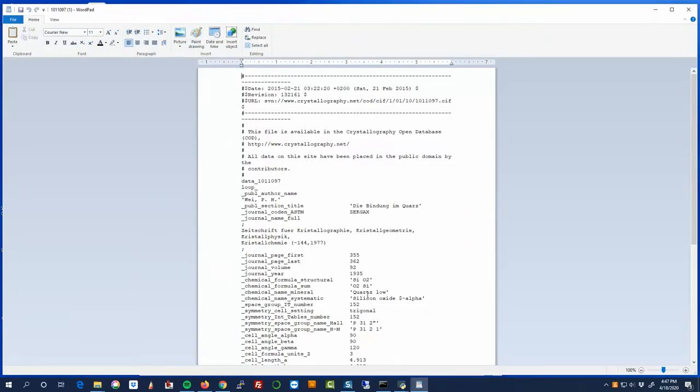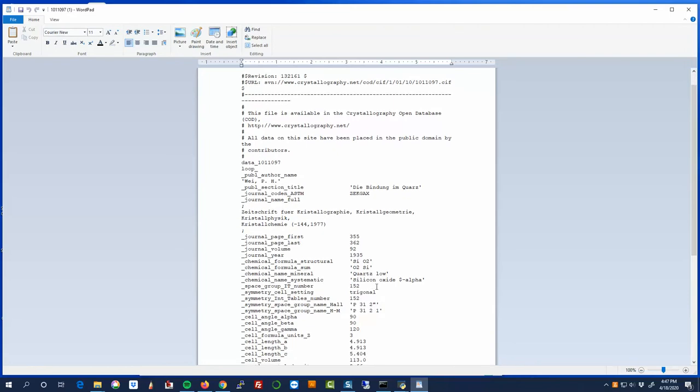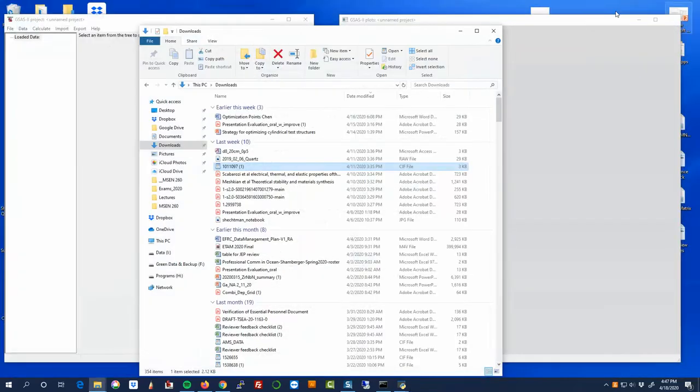So remember refinement, you always are starting from a known position. And so this is our first guess of what silicon dioxide or quartz structure is going to look like. And we know it's going to be a pretty good guess because a lot of people have looked at this before.